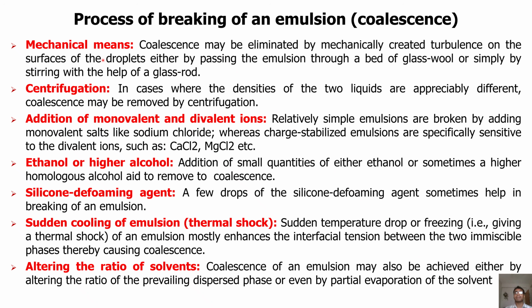Okay. First of all, mechanical means: centrifugation, addition of monovalent and divalent ions, ethanol or higher alcohol, silicone defoaming agents, sudden cooling of emulsion, then altering the ratio of the solvents.